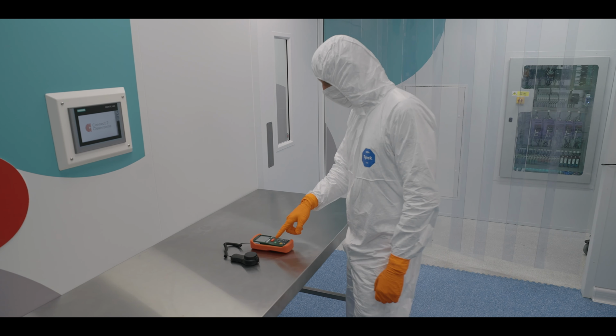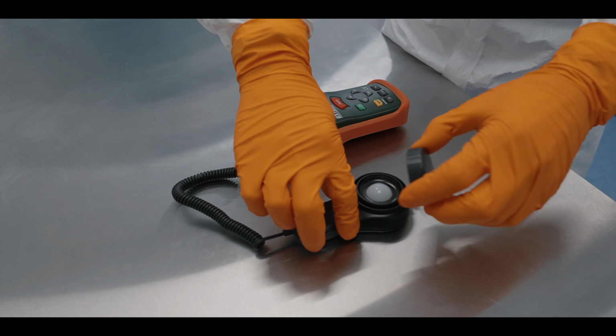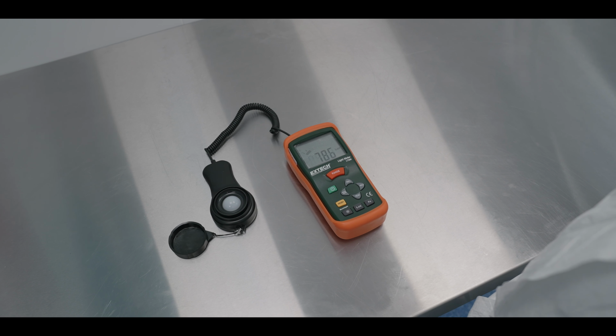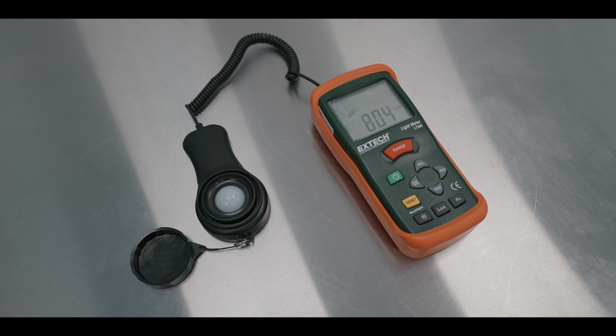In this next test we will be looking at light level readings. Lux level testing measures the light intensity using a lux meter by placing the device onto multiple cleanroom surfaces. Under ISO and GMP standards, cleanroom lighting should be non-contaminating, flush mounted or recessed where compatible with airflow. It's recommended that light levels are greater than 500 lux to ensure personnel can effectively perform tasks and product integrity is maintained.